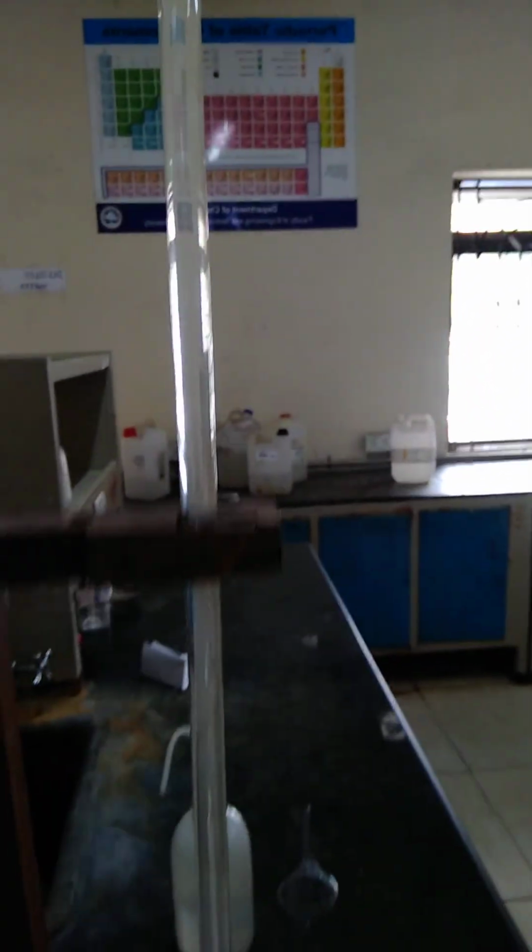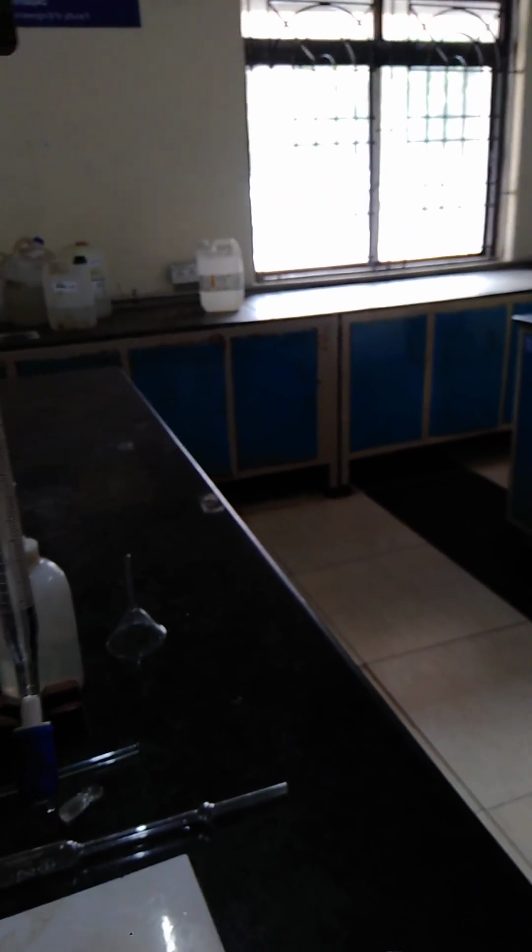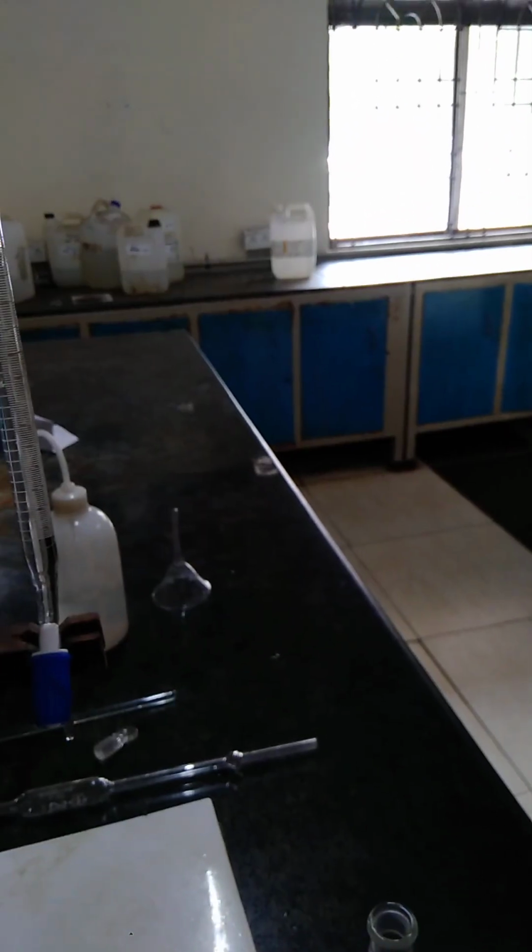Then go for the titration against the burette solution. We'll get the color change according to the estimation. Once you get the color change, note down the burette reading according to the meniscus. Follow the reading. Then repeat once again to get the concordant value.